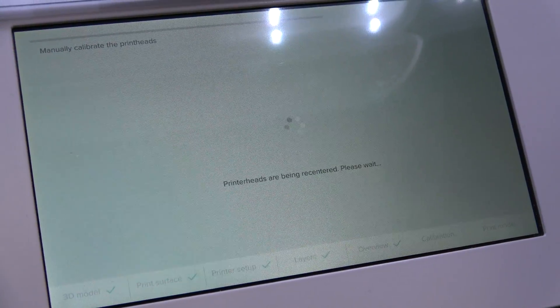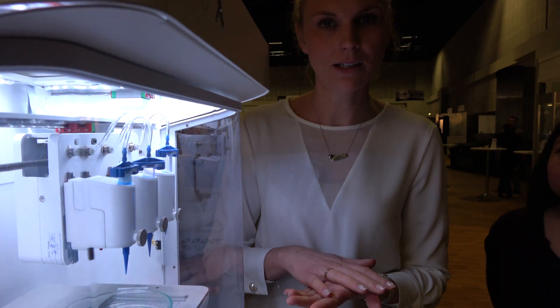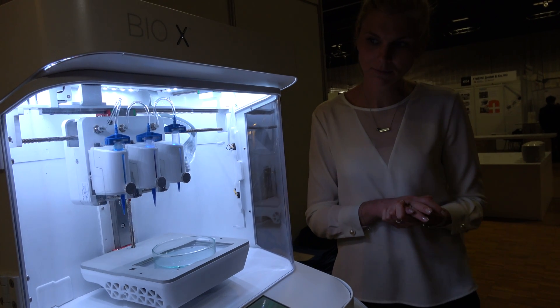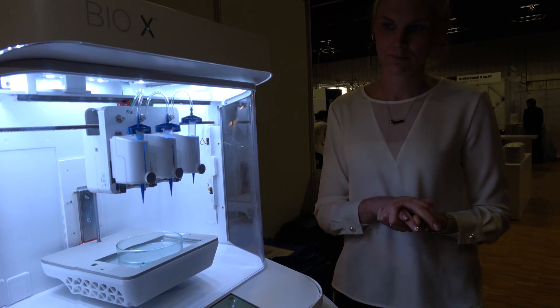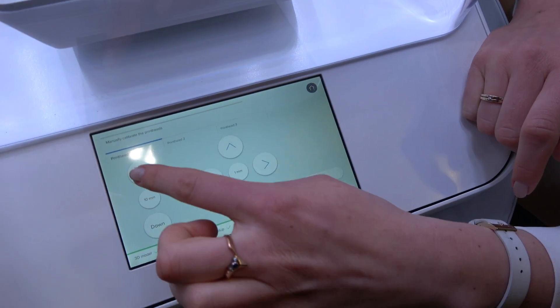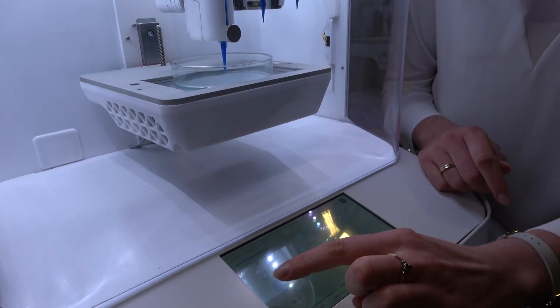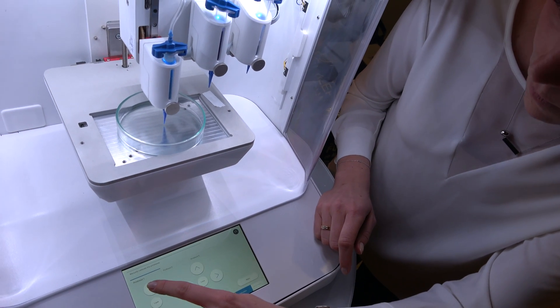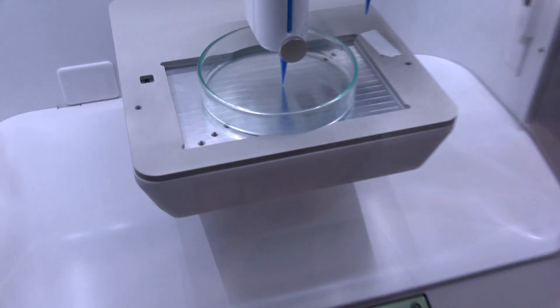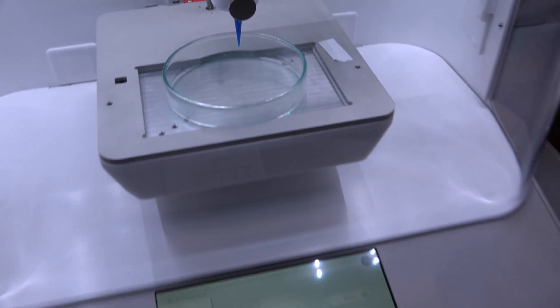The next step is calibration. That is done automatically in the X and Y direction. The Z is currently set manually, but it will also be automatic in the future. Here you can set the zero point and choose the step size — 10 millimeters, 1 millimeter, or 0.1 millimeter. You want to get as close to the surface as possible without touching it, then apply, and you're ready to bio print.